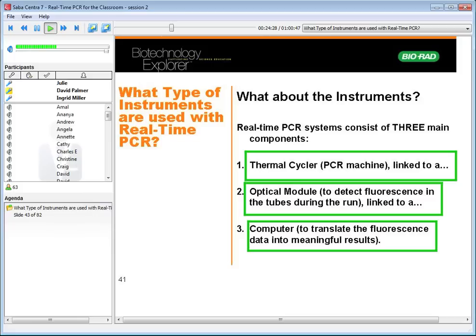It also does what I call demystifying the black box. Instead of putting the PCR tubes in the PCR machine and closing the door and that's it, now students get to see what's going on there. They see fluorescence increasing in those wells based on what the computer is telling them. And even the temperature control of the PCR machine, the controlling software will show you what temperature the lid's at, what temperature the block's at. And I've seen students get really interested in just that aspect alone.